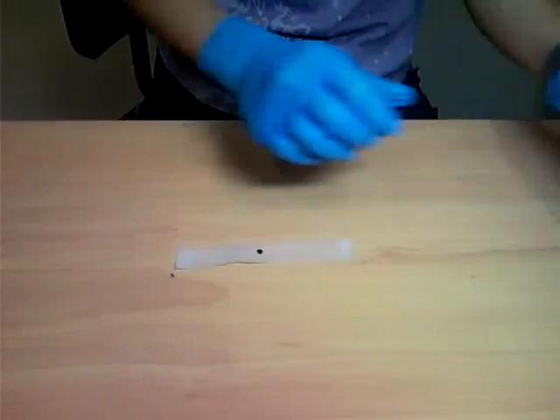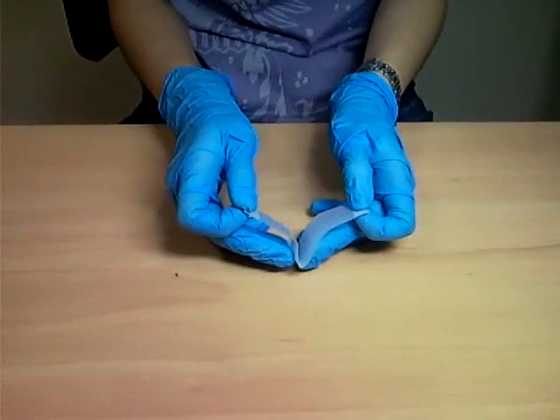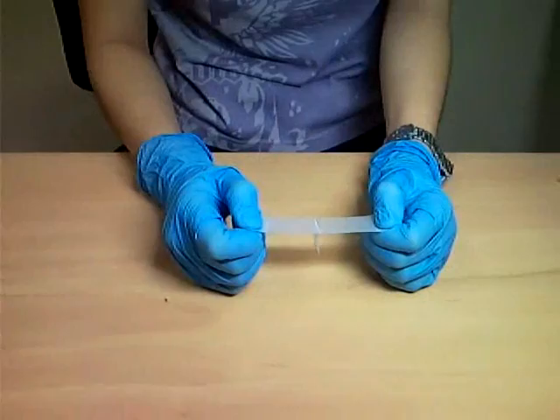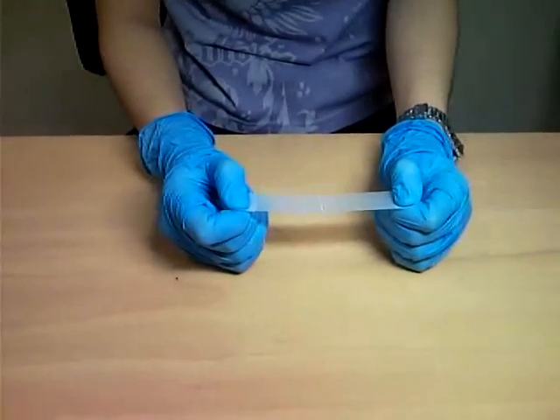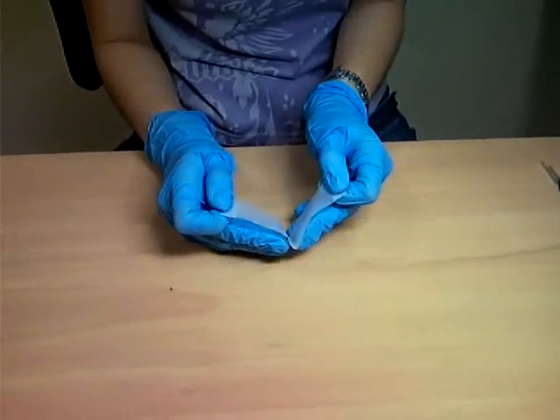Next, fold the scotch tape at the edge of the graphite flake. Peel it off gently and do this step several times until you obtain a nearly transparent region on the scotch tape.